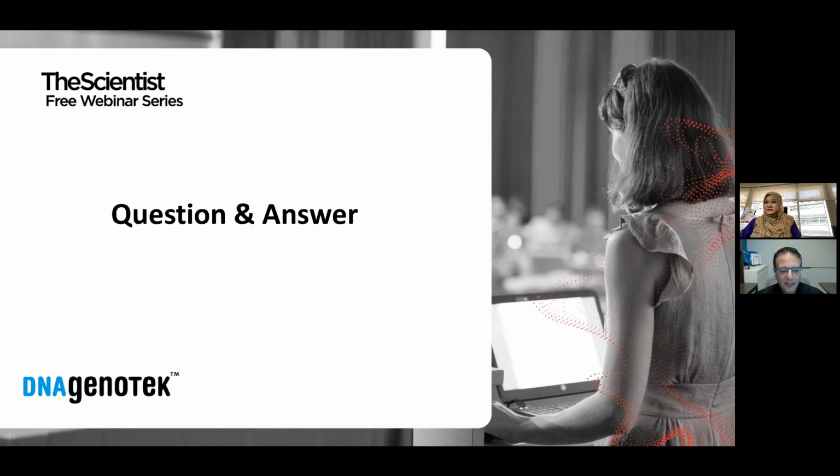So first of all, the person has less available saliva to collect at that particular moment. And freshly generated saliva doesn't contain quite as many cells. So when you eat, you're really clearing away the cells from the mouth. And it takes about 30 minutes to regenerate good cell content in the saliva. So that's the reason that we recommend you wait 30 minutes between eating and collecting a sample.